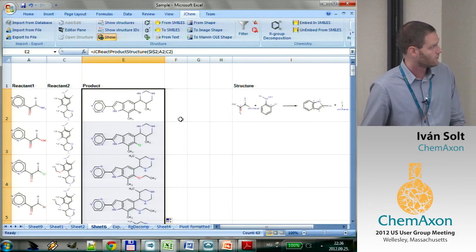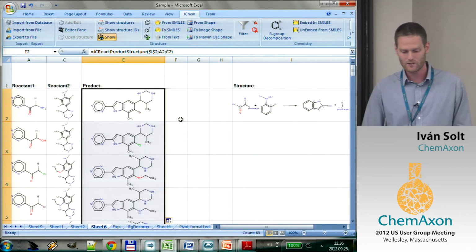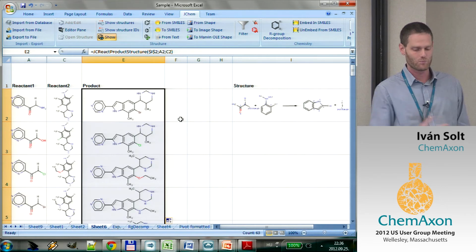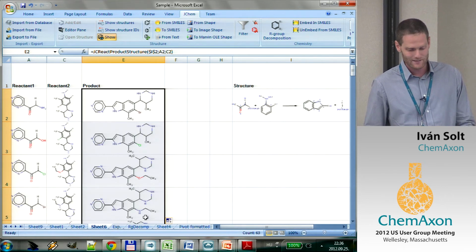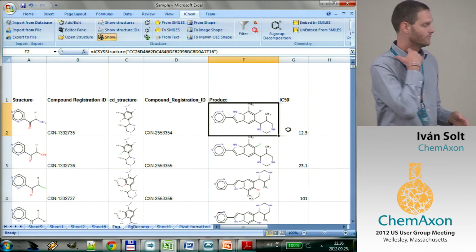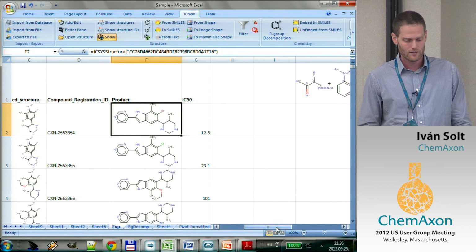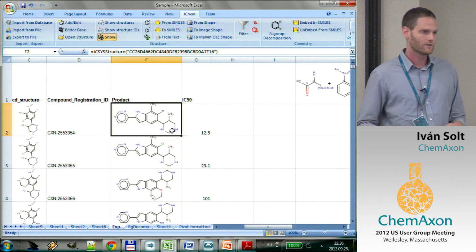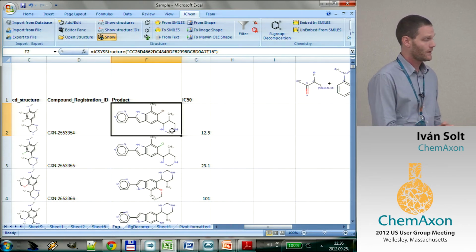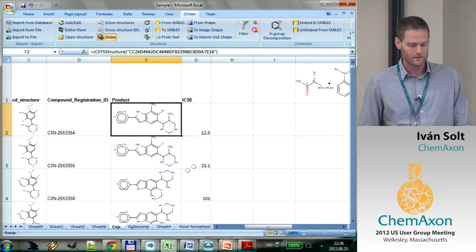Okay. Time flies. I speed it up a little bit. I sent these compounds to synthesis. They have synthesized it, and they got back with analysis results. So what I get is a set of IC50 values for a subset of these compounds. Now, what I would like to know is actually how different the variable side chains around the methylindole backbone or scaffold are affecting the IC50 values.